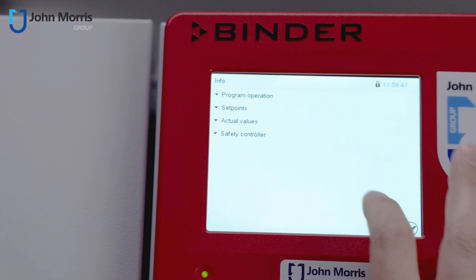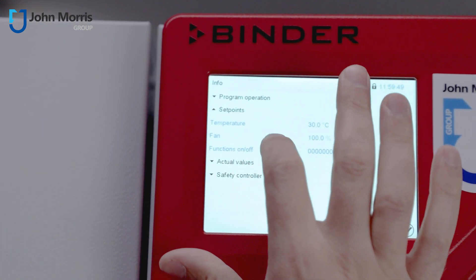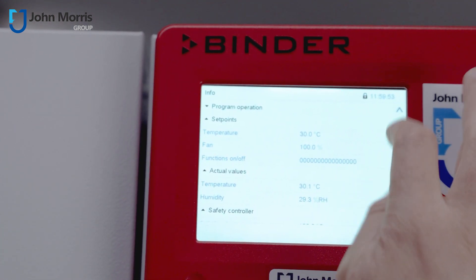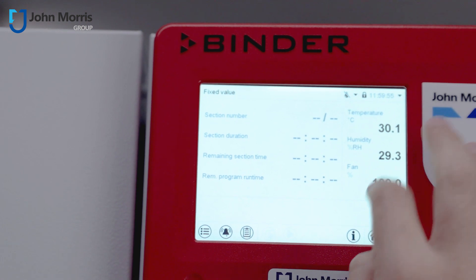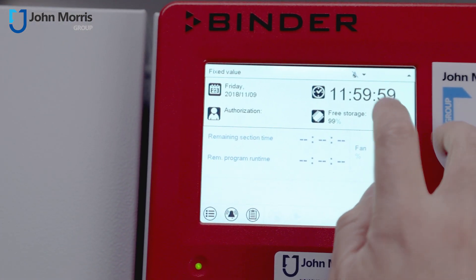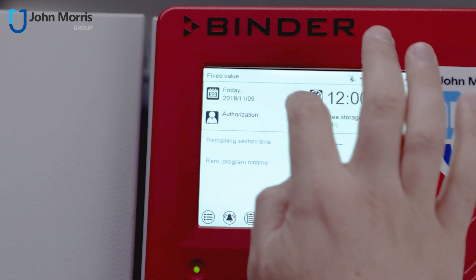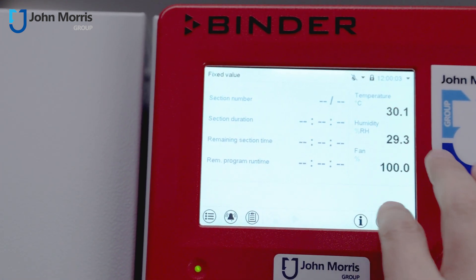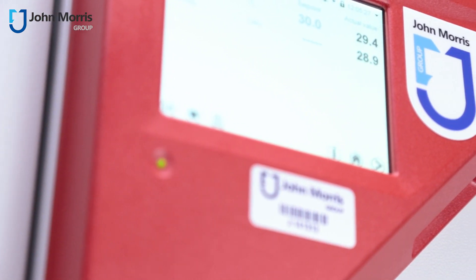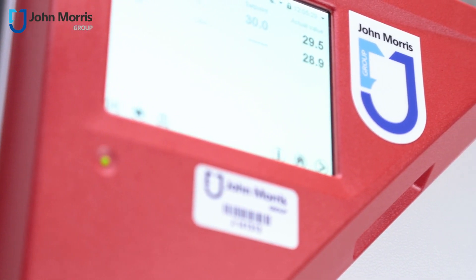You have a really nice touchscreen digital display up here, and that enables you to do all kinds of things like set up different runs where you can have heating and cooling and different humidity controls. We also have a nice USB port right here so that you can take all your recorded readings with you.